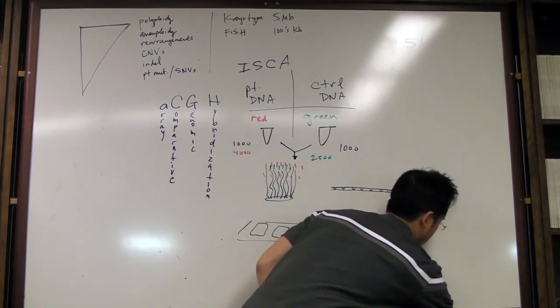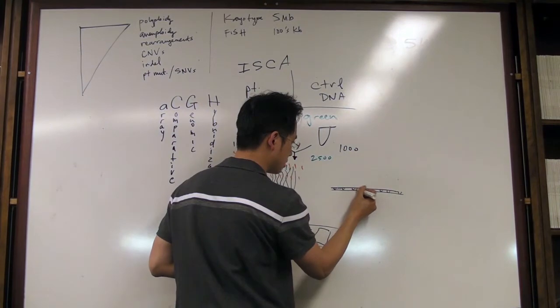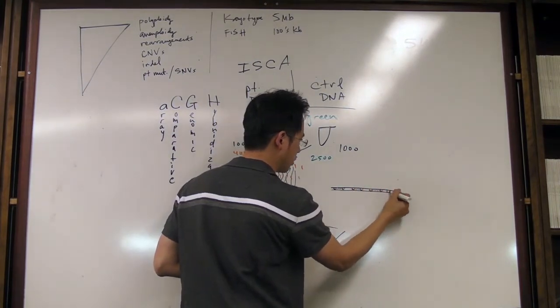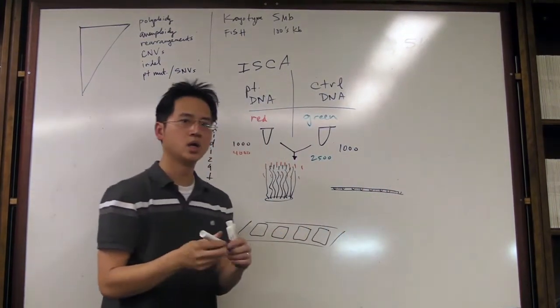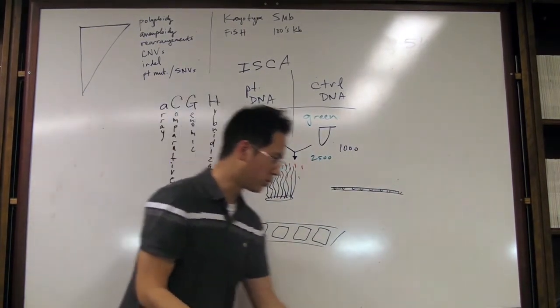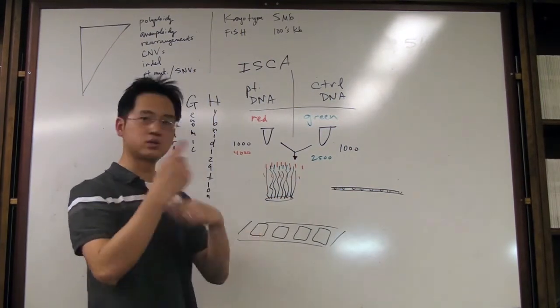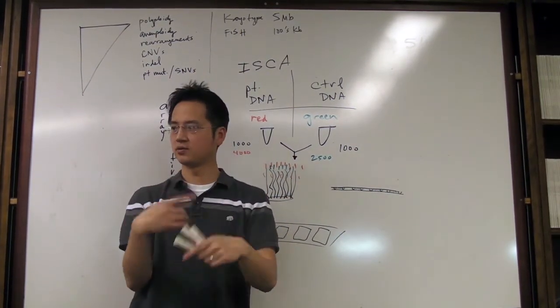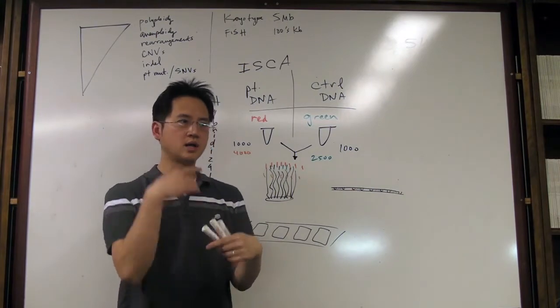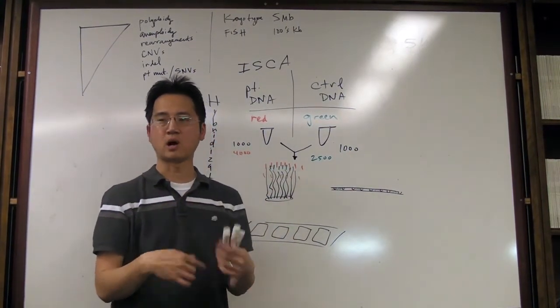What you have is 4 individual hybridizations that occur. So the liquid is trapped in here. It's roughly 100 microliters or so, where you mix the two samples, some hybridization solution, some blocking solution as well. But you put this slide into this rotisserie that operates at 65 degrees temperature and is rotating constantly during this 48-hour incubation or hybridization.